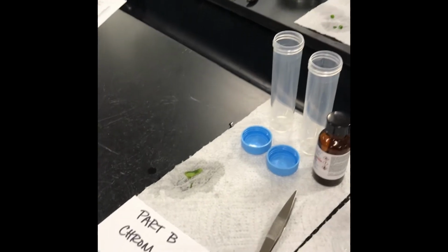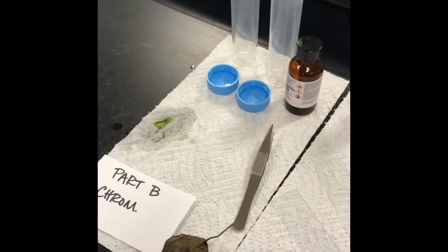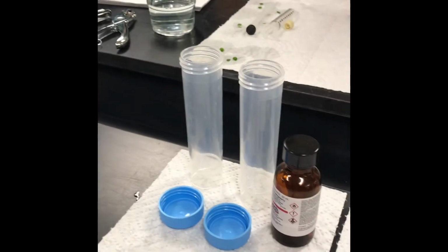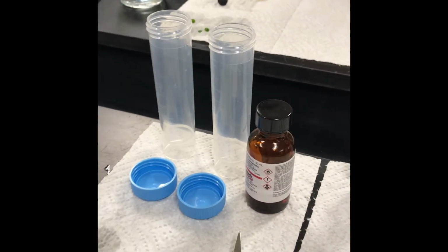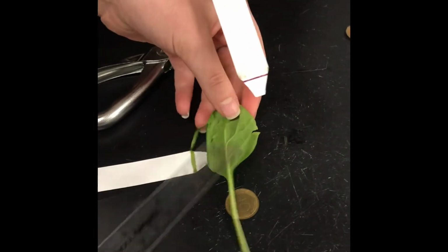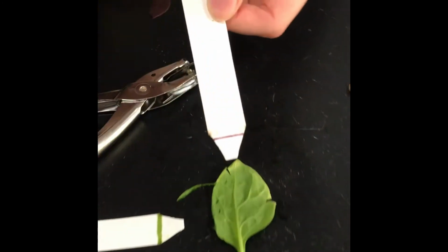Okay guys, so this is part B of the AP Photosynthesis Lab. This is the chromatography. So we've got these vials that they're going to add some chromatography solvent. If you look right here, chromatography solvent. They're going to add a little bit to the bottom in a second, but right now, look at this magic. They have 2 pigment lines. One of them, you can see kind of like the reddish color.